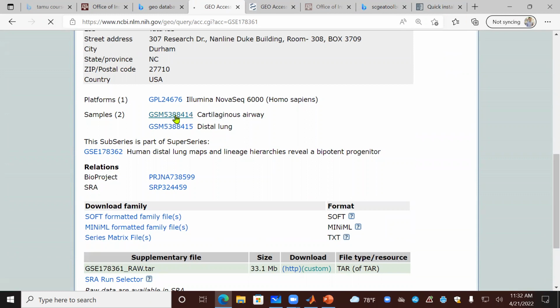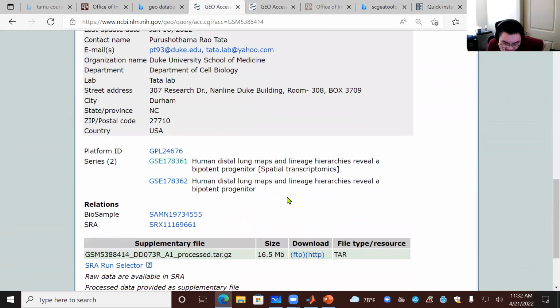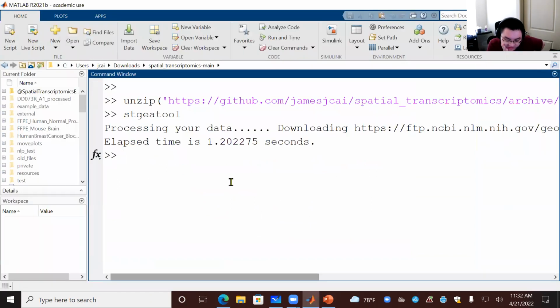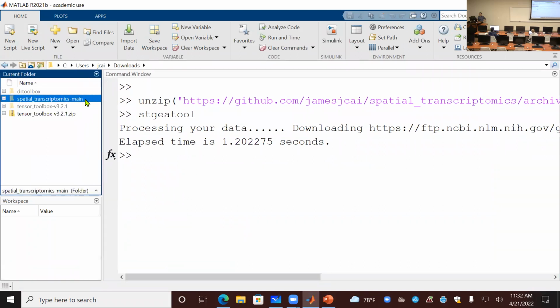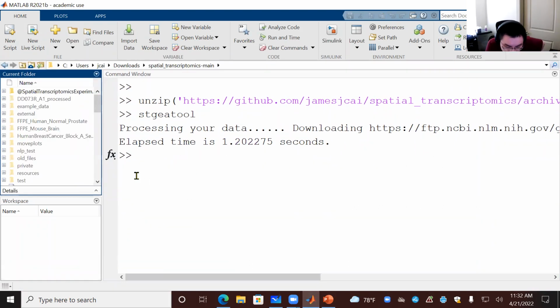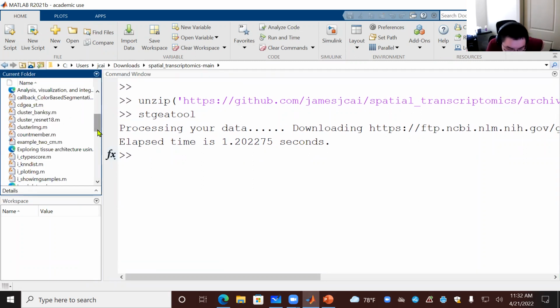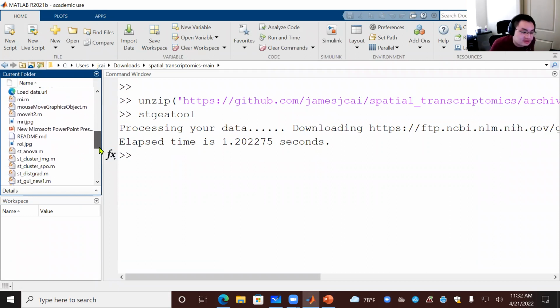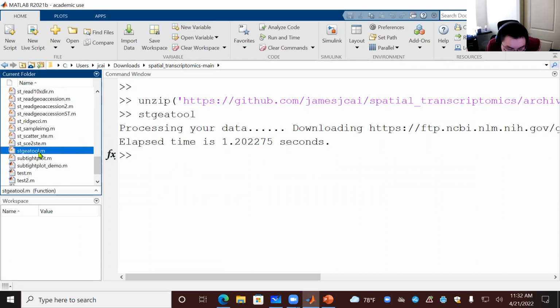I'm getting an error that says that its STGA tool is not being recognized. Yeah, you should. Have you seen this? Yeah, I'm in the folder. I also think I changed my directory to this folder with the CD command, and it's still not. I don't even see the tool command on the left though. Yeah, I don't see it there. Do you have this?